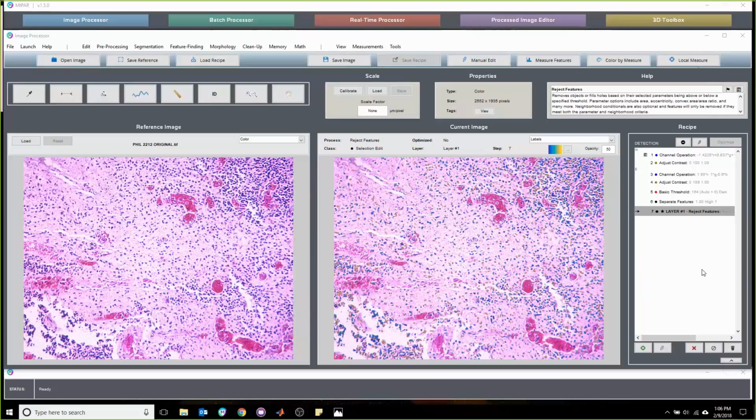But like he also mentioned, we're in the process of working on a graphical tool that'll let you do the tracings and calculate the deconvolution matrix for yourself, all inside of MIPAR, so that you can come up with the channel operations yourself. To this date, most folks have been very happy to just receive recipes with the channel ops hard-coded in that work for their particular deconvolution case.